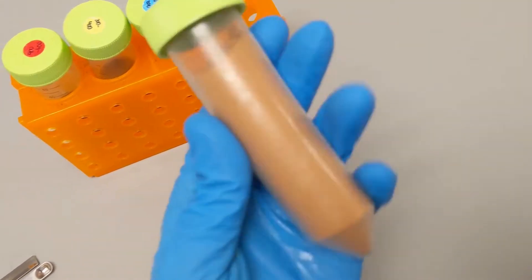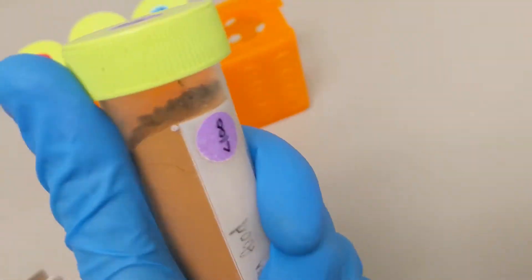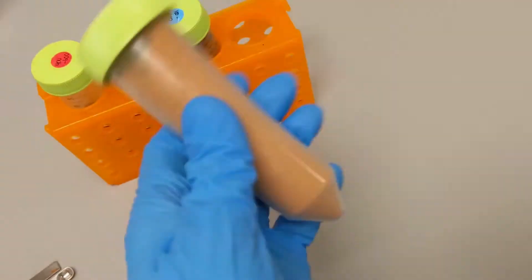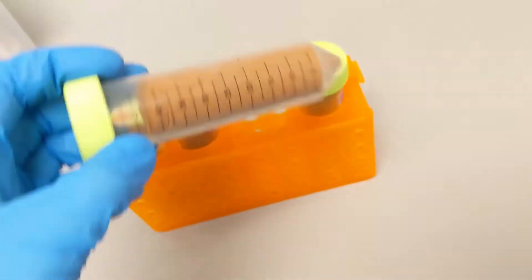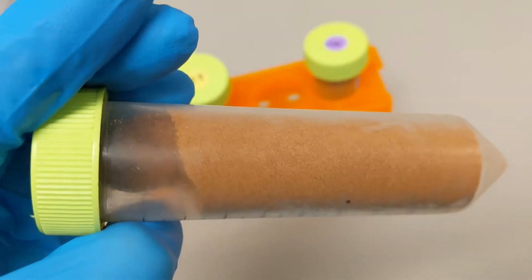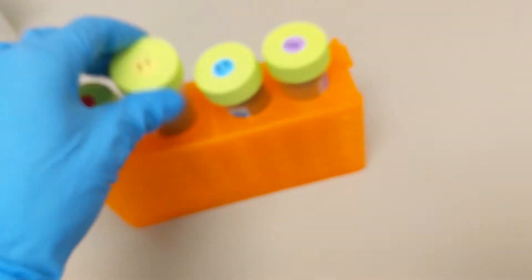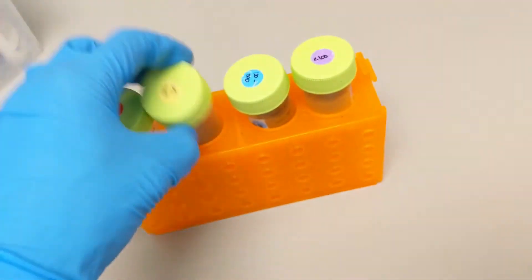The smallest feed that Sparrows provides is less than 100 microns — a powdered form that even the smallest baby fish can eat. As the baby zebrafish grow, they can start to eat larger foods such as the 100 to 200 micron pellets, 200 to 400, and then finally the 400 to 600 micron pellets as adults.